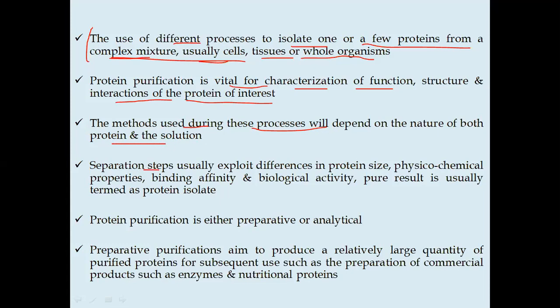The separation steps usually exploit differences in protein size, physico-chemical properties, binding affinity, and biological activities, and the pure result is usually termed as protein isolates.